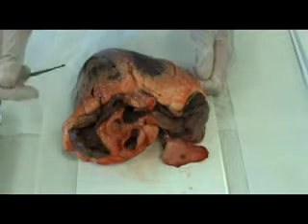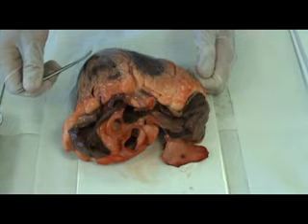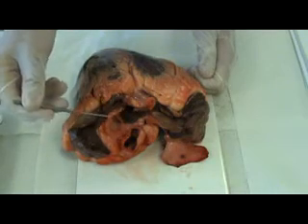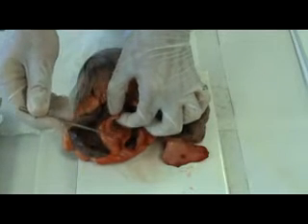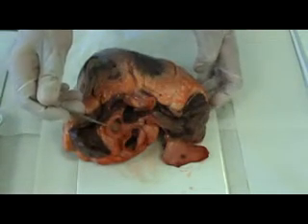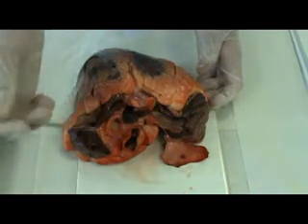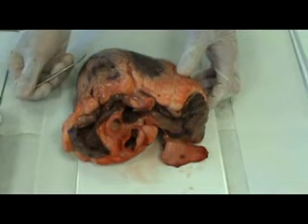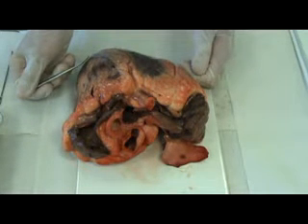The blood, once it enters the right atrium, would need then to be pumped into the right ventricle, and the right ventricle is only going to pump the blood out through an artery, and here's part of that artery, also thick-walled. And this is the pulmonary artery. It's carrying deoxygenated blood back to the lungs. The reason it's an artery is to speed up the flow of the blood back to the lungs. In other words, we want to get rid of the carbon dioxide as quickly as possible, so deliver it quicker to the lungs. So there we have the superior surface of the heart and the major blood vessels.